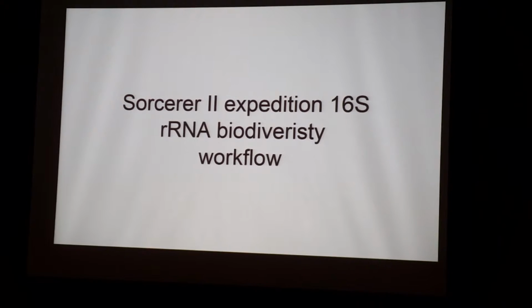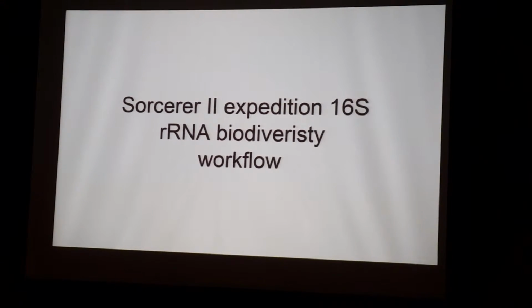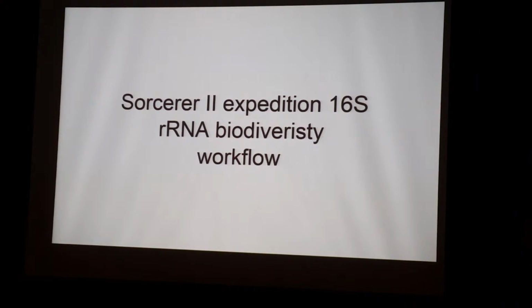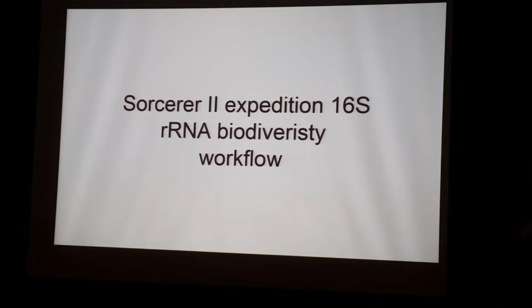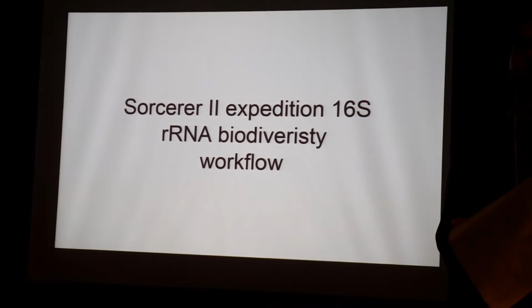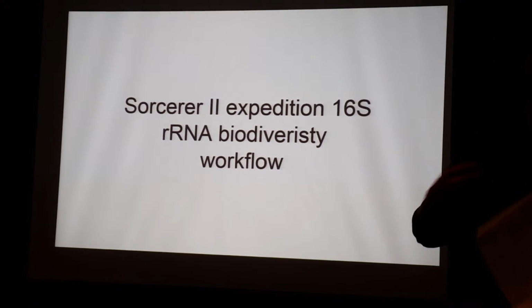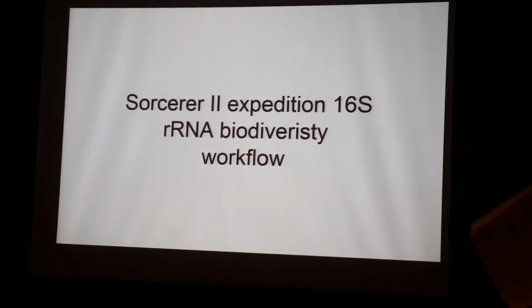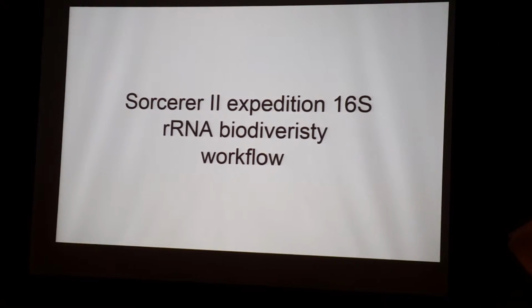And the alternative is to use a web-based program. There are a few of these available. There are very strict limitations in terms of what size file you can upload, how many files you can upload, the speed at which it processes, and sometimes there are even privacy concerns. There are a few products on the web that are available, but they require you to give away permissions to use the data in other cases, which isn't always a good idea.